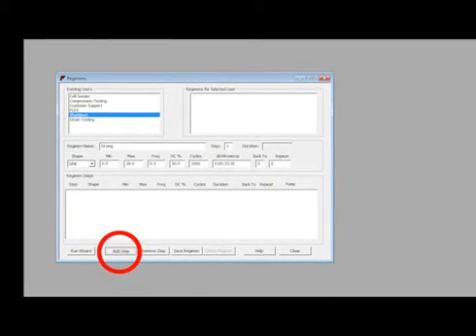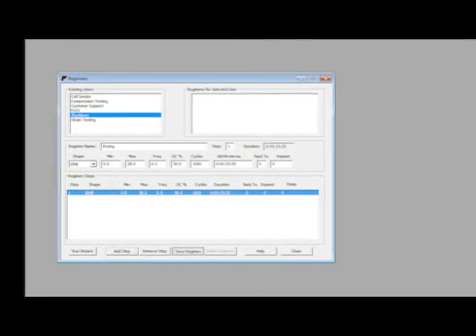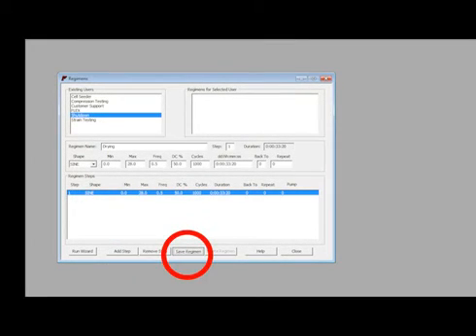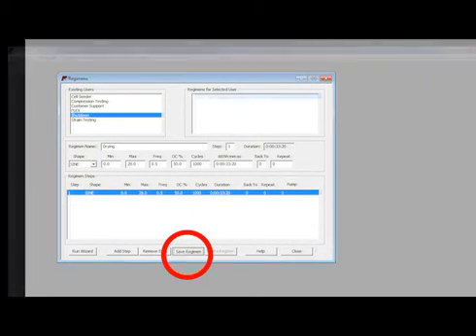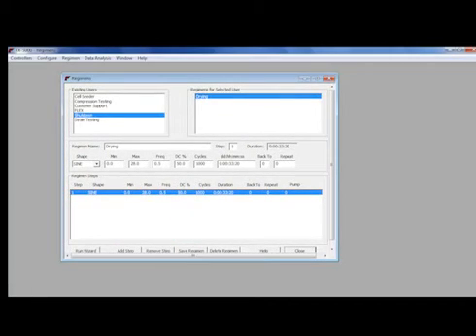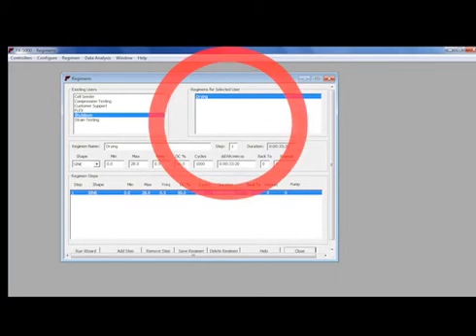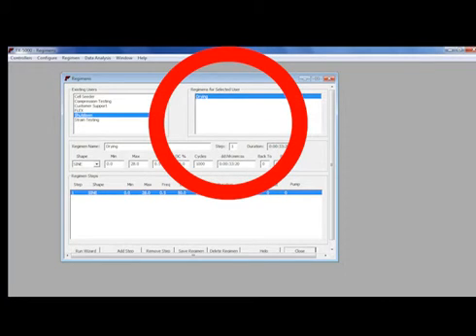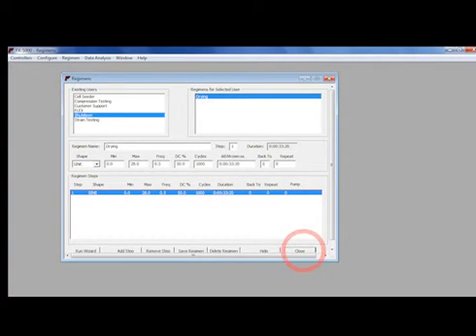Then click Add Step. Next click Save Regimen and the new regimen will appear in the Regimens for Selected User Box. Next click on Close.